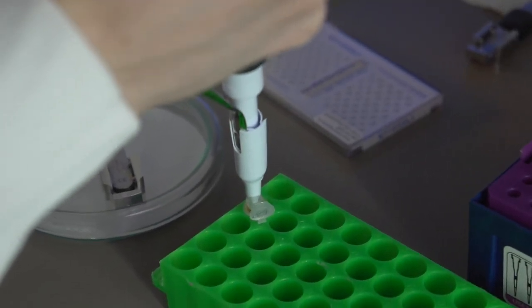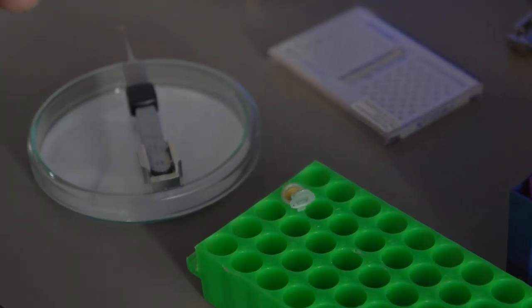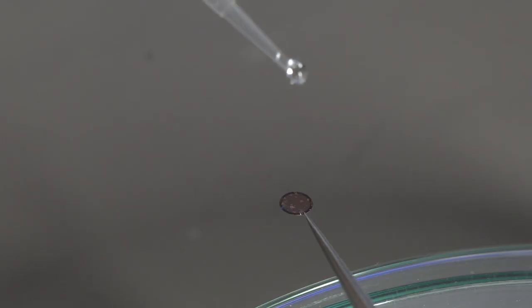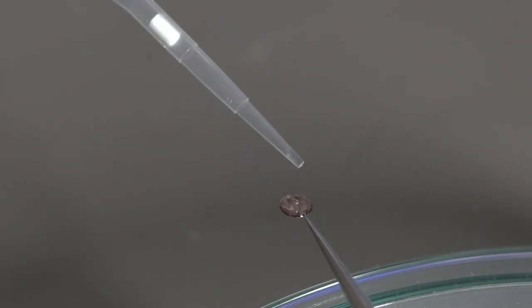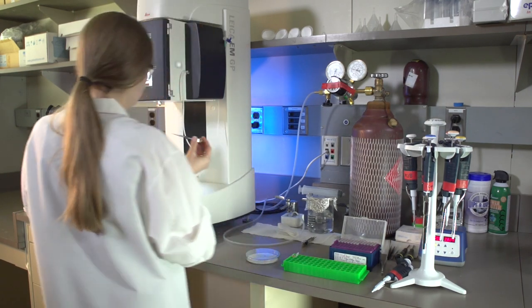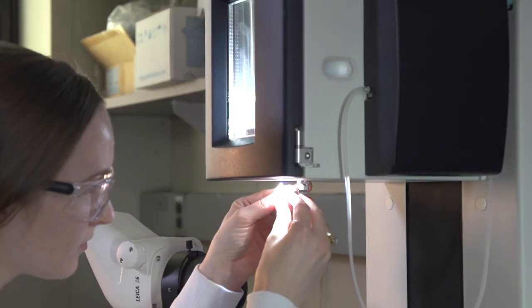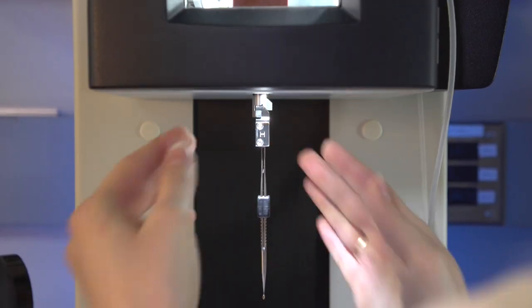We are teaming up with Duke and UNC to establish the Molecular Microscopy Consortium, a collaborative training environment. We aim to advance the field of structural biology by helping local scientists incorporate this powerful tool in their laboratories.